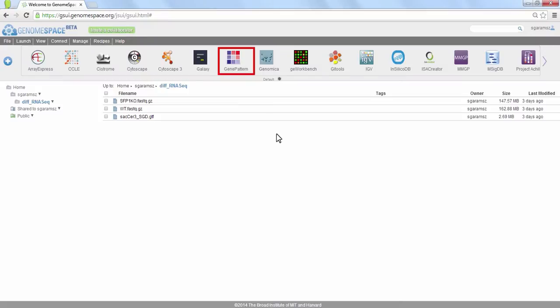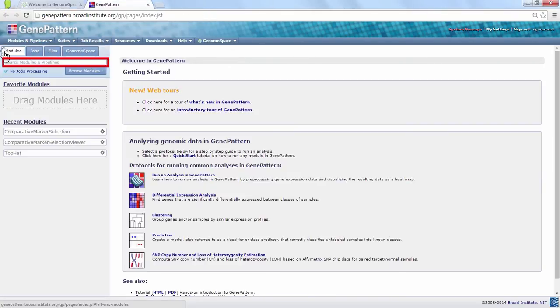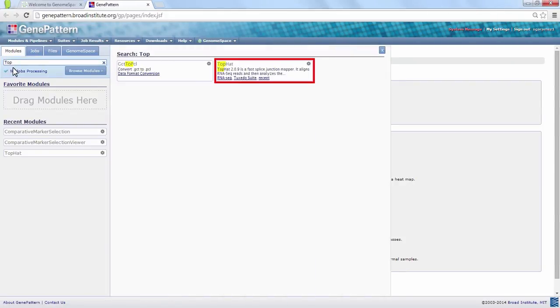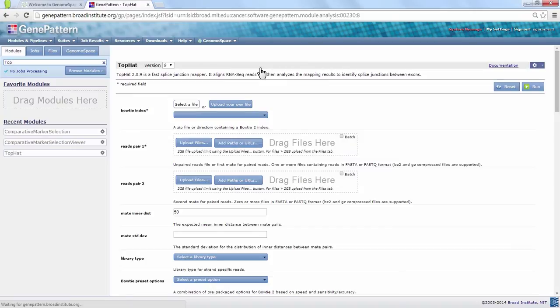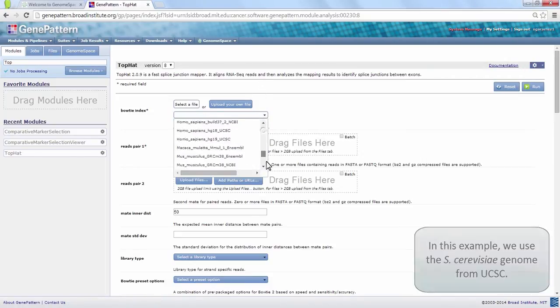Launch GenePattern by clicking on the icon in the toolbar. Click on the Modules tab and search for the term TopHat. Click on the TopHat module when it appears in the window. You can also find modules by browsing through the entire listing, but searching is usually the most efficient method.